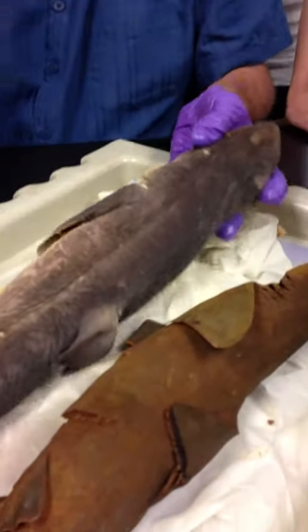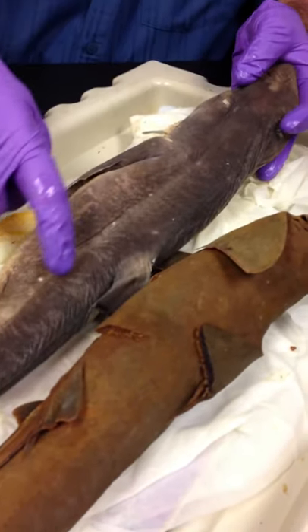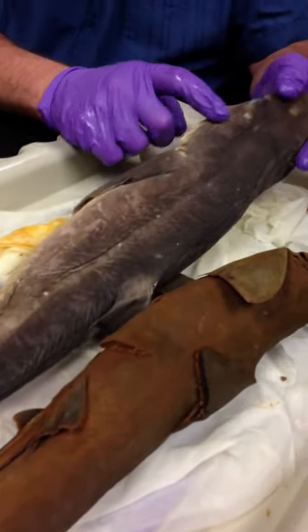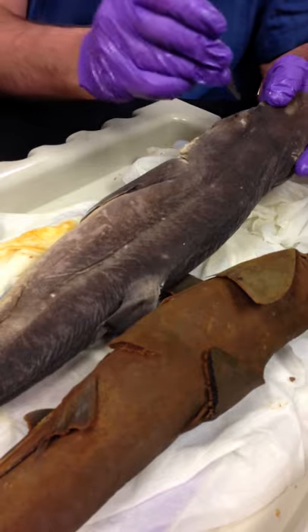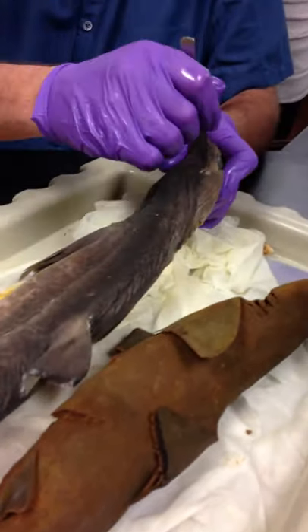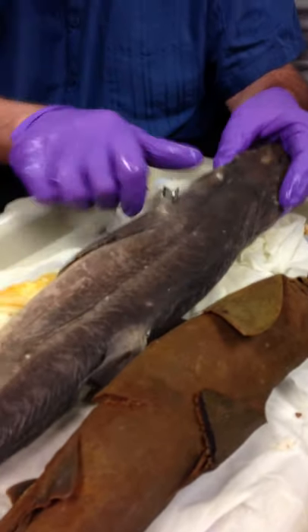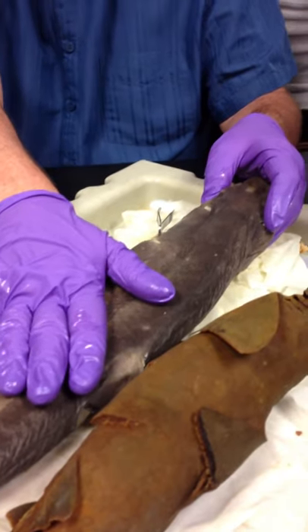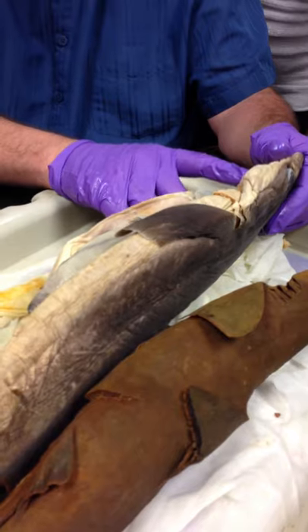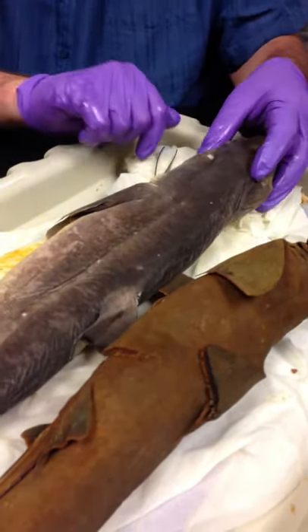Looking at the dorsal side, if we tilt your head, you can see a lateral line right here, all the way down. Same lateral line we saw on the fishes. And on the dorsal side we have this hole. That's the spiracle. It's a natural hole. I didn't just make that. That hole leads to the gill chamber, so she can ventilate her gills while she's lying down on the sand and doesn't get a mouthful of sand. But normally when she's swimming up higher, she opens her mouth and it goes through the gills and everything's great. When she's resting, she can use that for respiration.